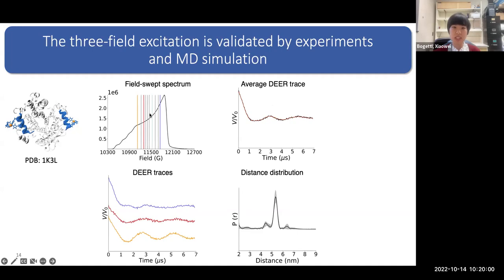So we perform 7 additional DR in between magnetic fields, and the 10 fields DR looks exactly the same as the 3 field in terms of modulations, and how deep the signal is modulating. And so does the distance distribution. They agree very well. Again, the MD sampled distance distribution shown up here in this blue dashed line agrees very well with the EPR measurements. And this piece of results is growing evidence that MD can accurately report EPR distances.